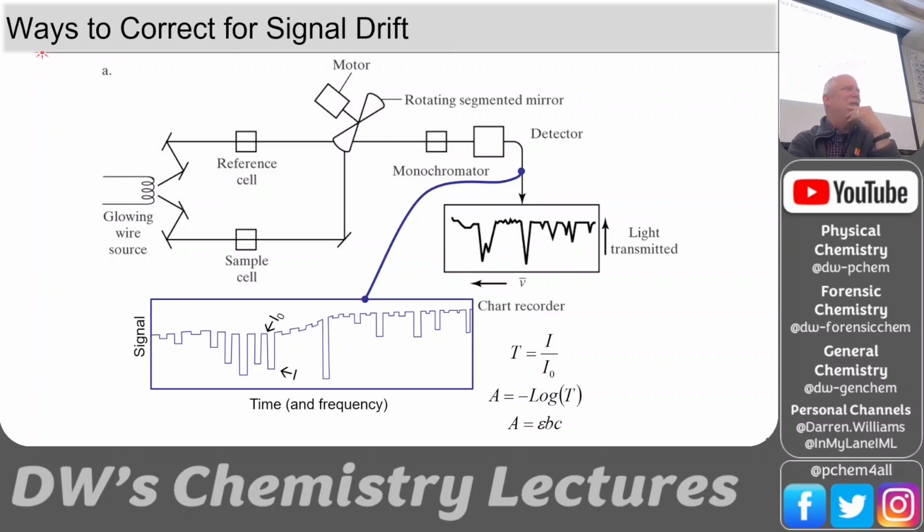The ones in Gen Chem were pretty, I mean, we don't have a lot of money to spend on that many little instruments and so on. So they have a problem with drifting. So let's talk about the Spec 20, where you've got just a single box, you've got the light, you've got a little cuvette holder, and you've got your detector.